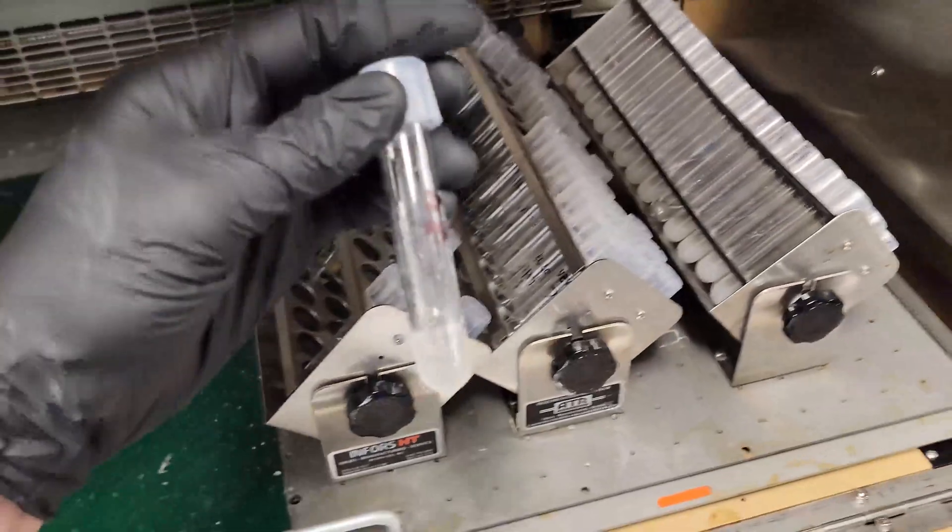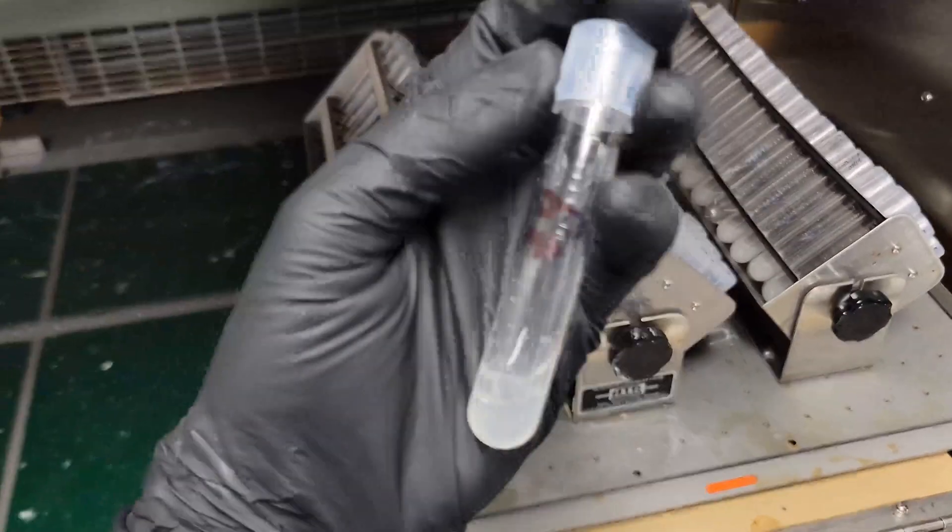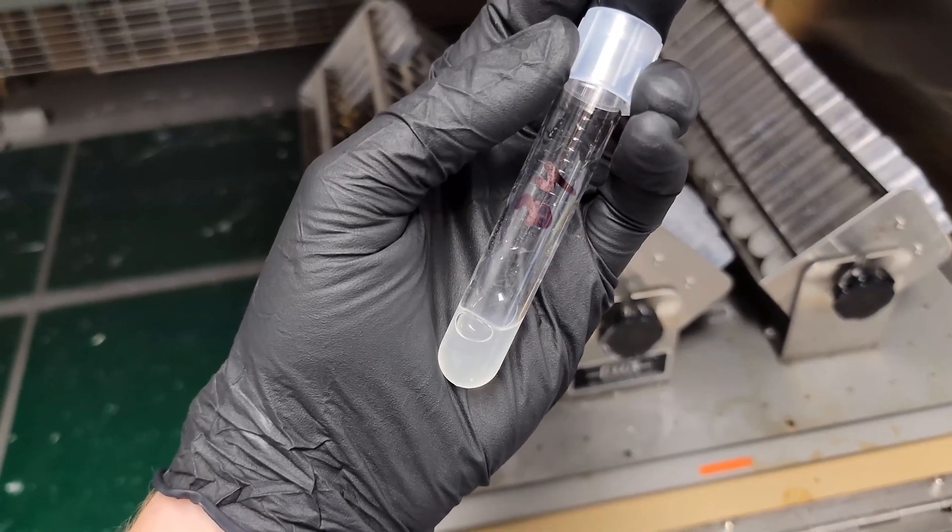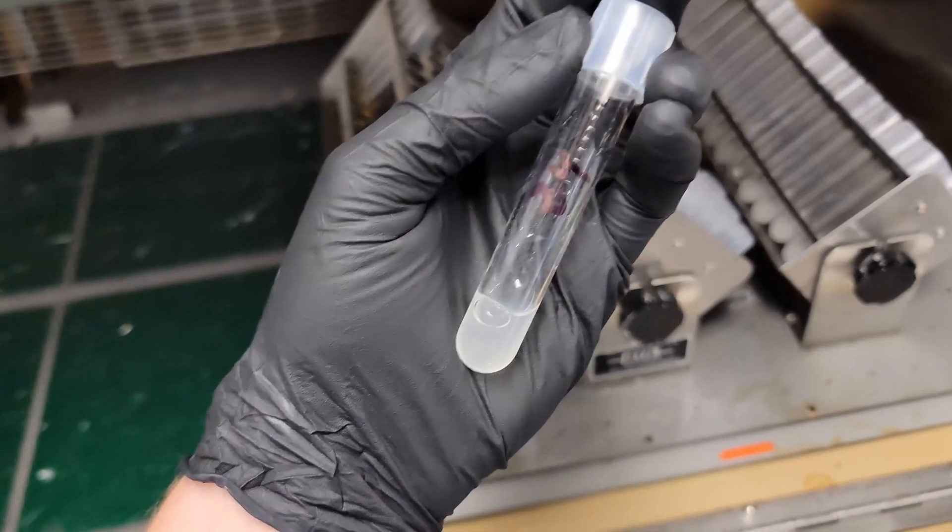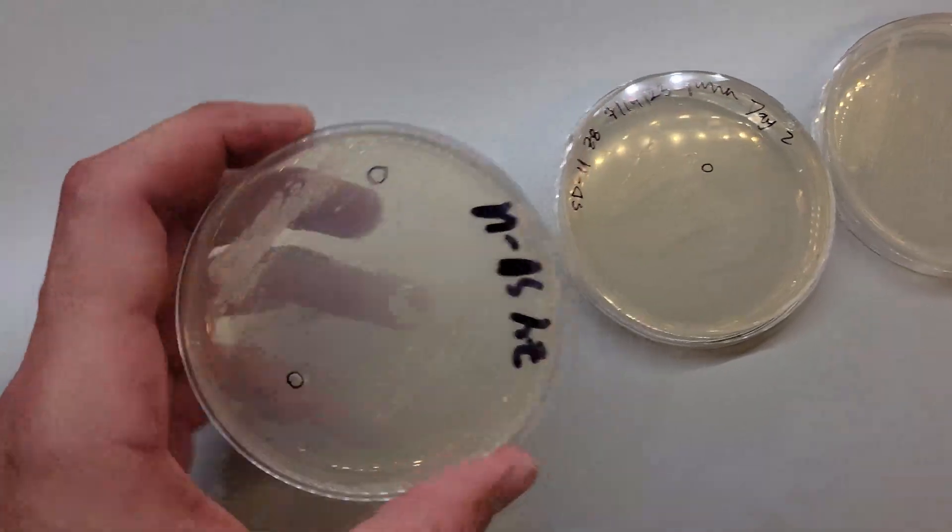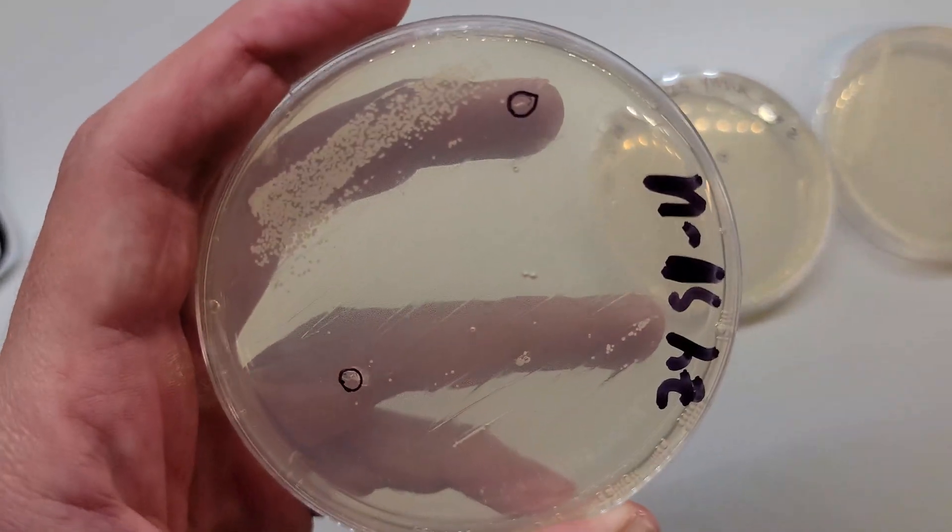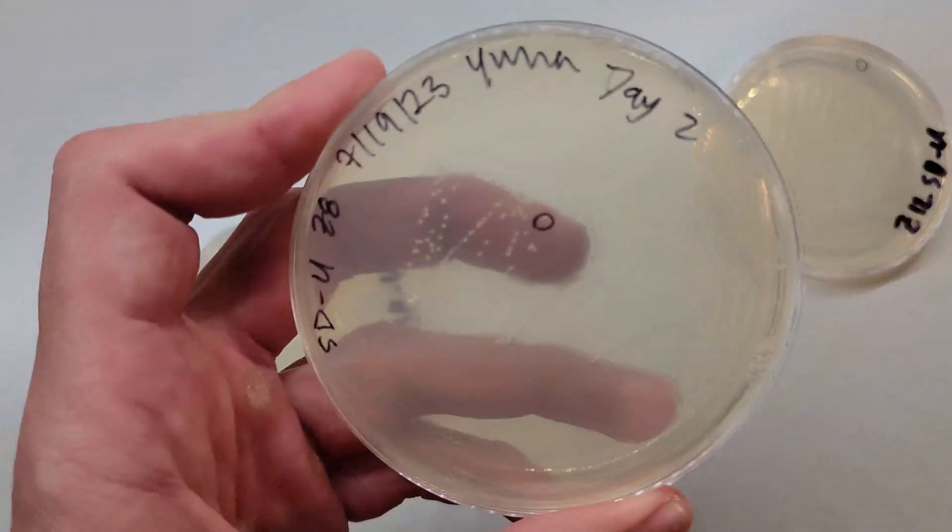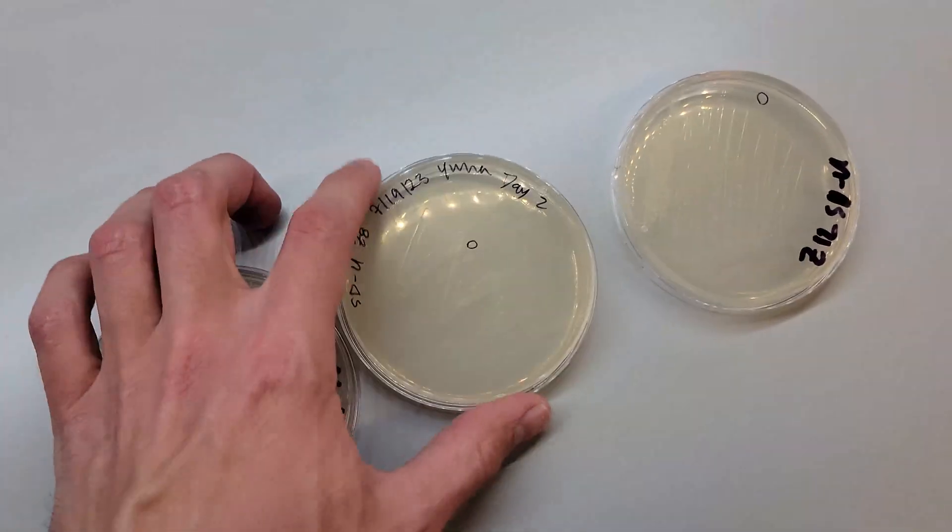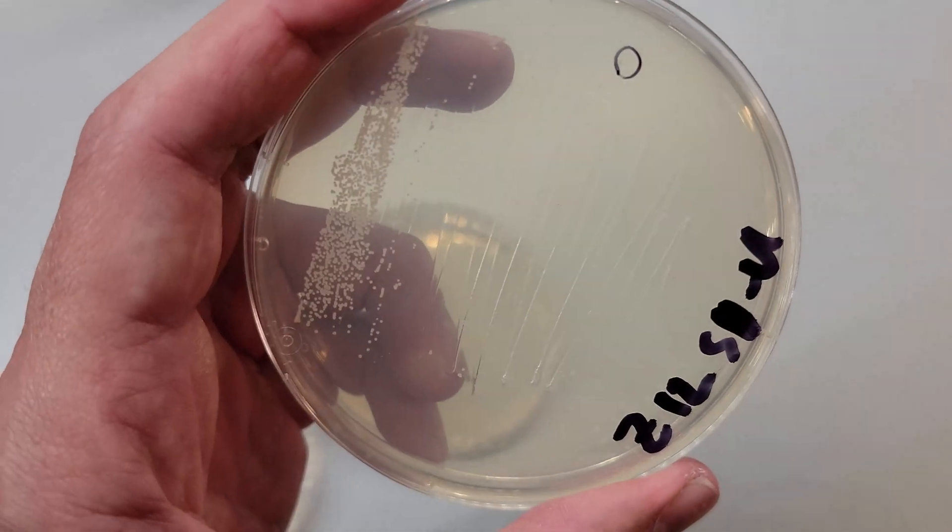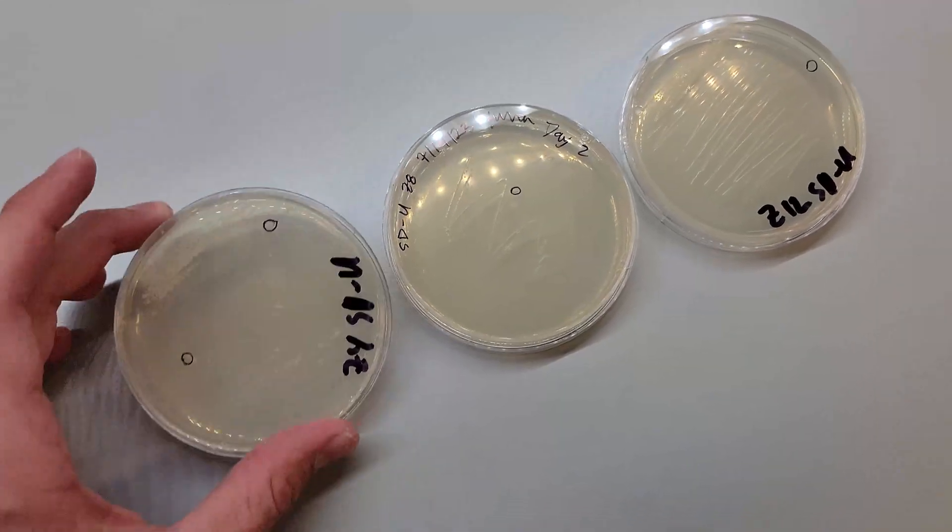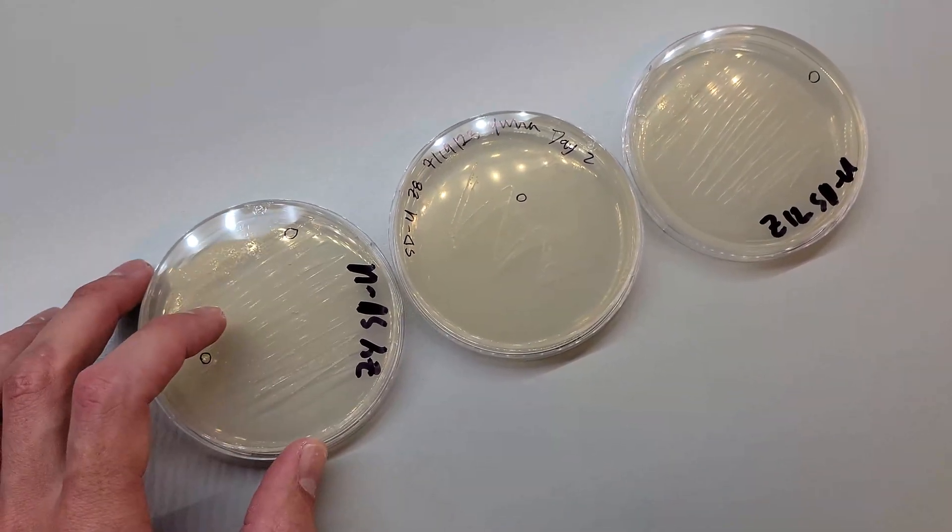Here's what they look like after two days. They've grown a lot, so I'm going to streak them out on Petri dishes. This is what the plates look like when they're streaked out. You can see we got colonies on all of them. This is selective media plates and we got single colonies, so these should have our plasmid.